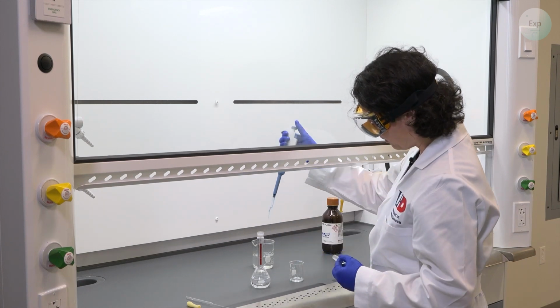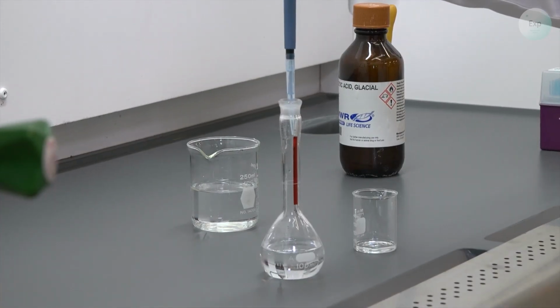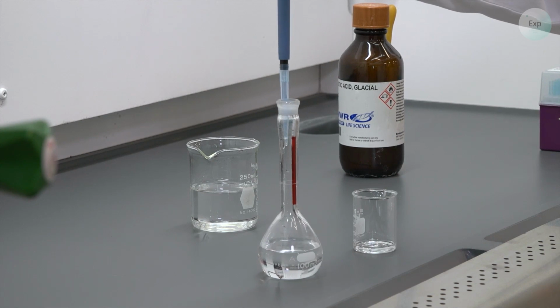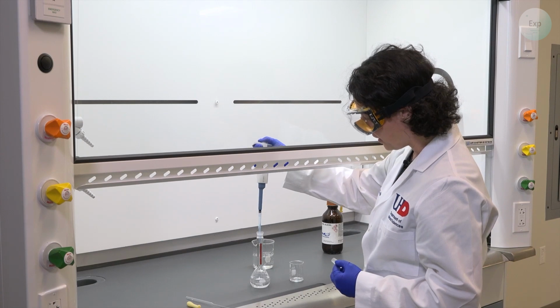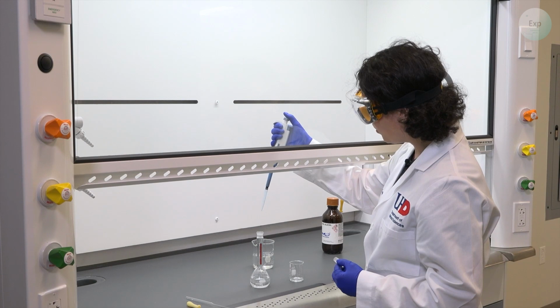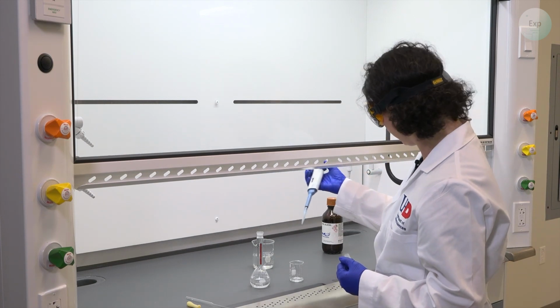move our micropipette tip inside the container, and then we push the plunger into its second stop. Once it got there, we wait approximately 2 seconds. And when we are done, we lift out our micropipette, let go of the plunger, and remove our used tip.